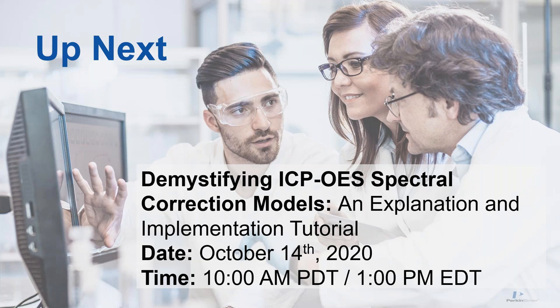So a few more questions here. I'm just kind of going through them. Do you provide information? Okay, we talked about that. Oh, so here's a question. How did you know the exact concentration of the elements causing interference in the arsenic analysis?